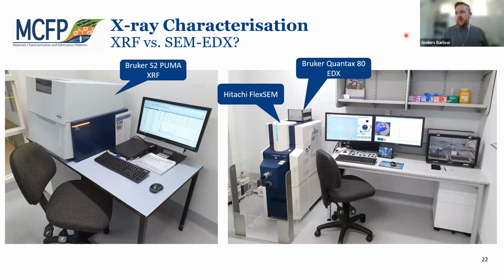Okay, just before we wrap things up, the final thing I wanted to touch on is a question I get asked quite a lot, which is, which should I use, XRF or EDX, when I'm looking at my samples? So I just wanted to highlight the two techniques here right at the end before we wrap up, to really compare the two with you. So I've given you an introduction about the XRF already.